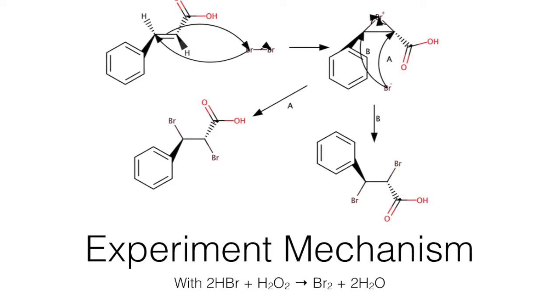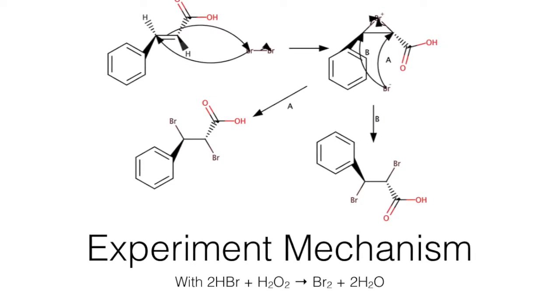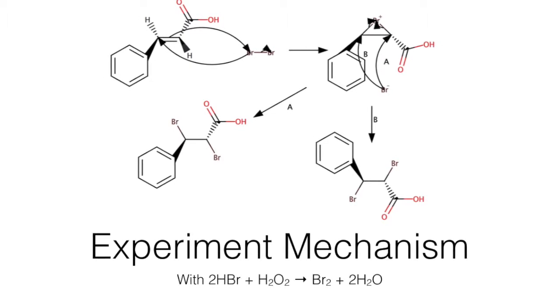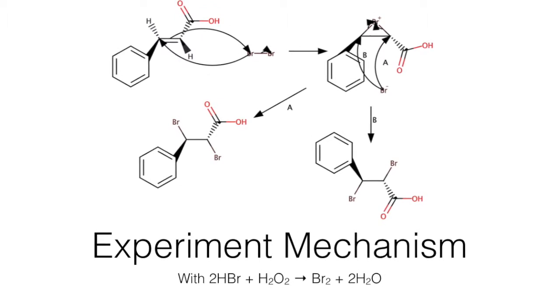The carboxylic acid stretches in the intended product would also be seen between 1760 and 1690 centimeters to the negative 1 for the carbon double bond with oxygen, and 1320 to 1000 for the carbon-oxygen single bond.